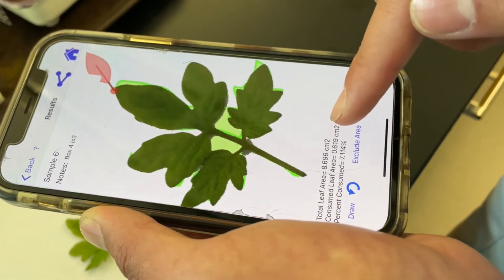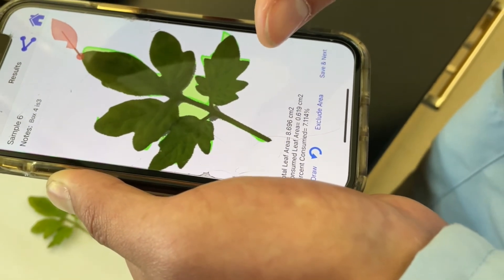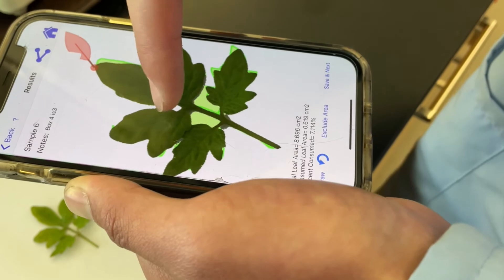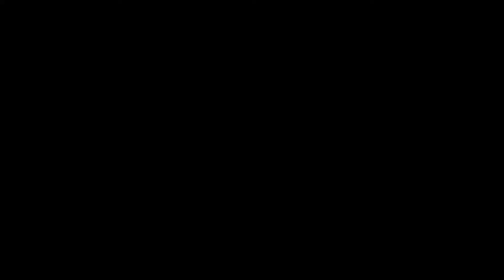So then you have total leaf area there. The consumed leaf is if you're doing a simple leaf and you're seeing bites out of it — you just trace over the bite. But otherwise, just tracing the compound leaf should be sufficient.